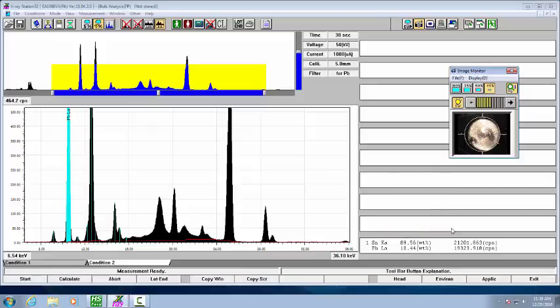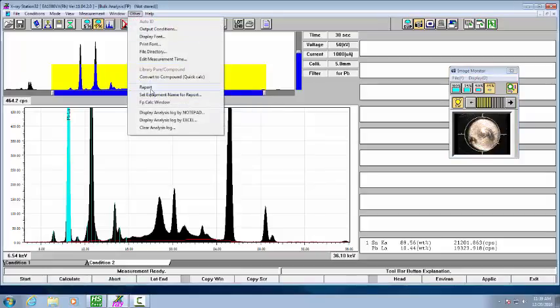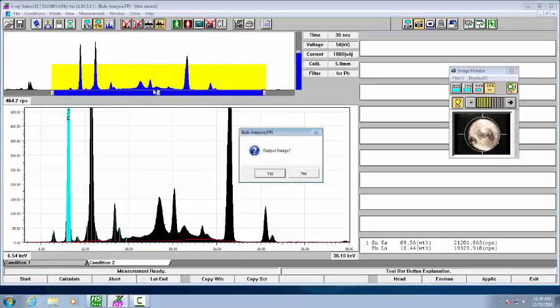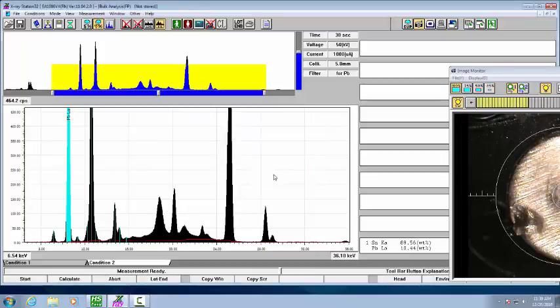And now you might want to create a report. So we go up here to Other, Report, Output the image.